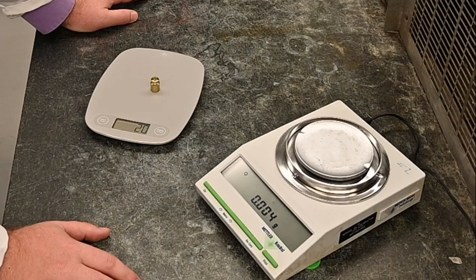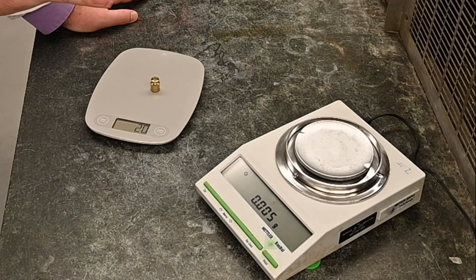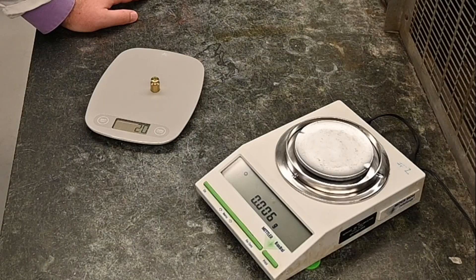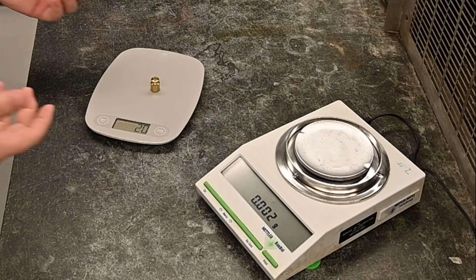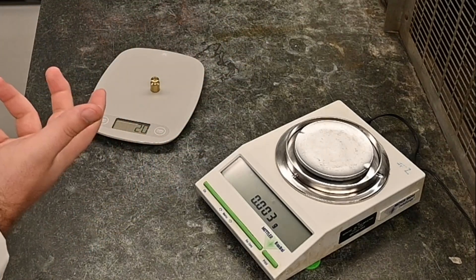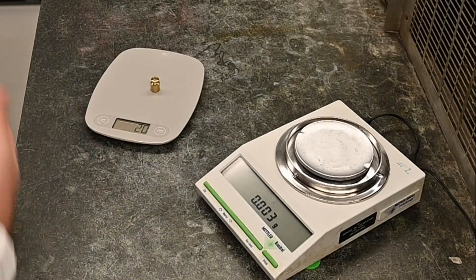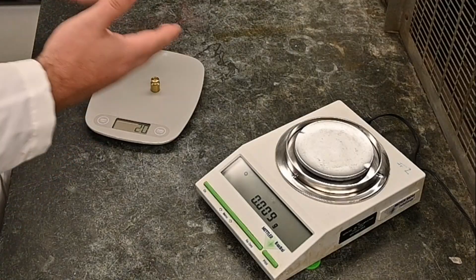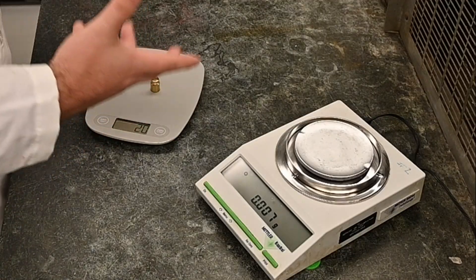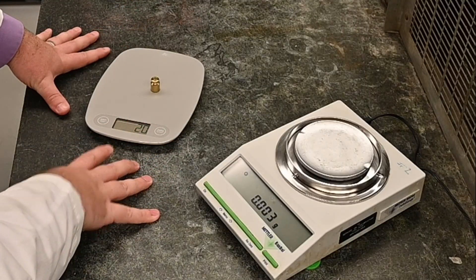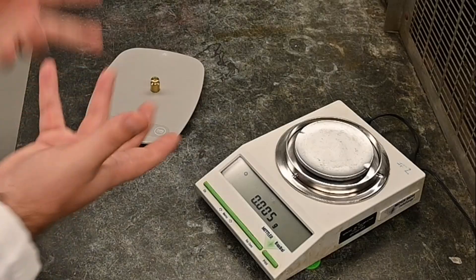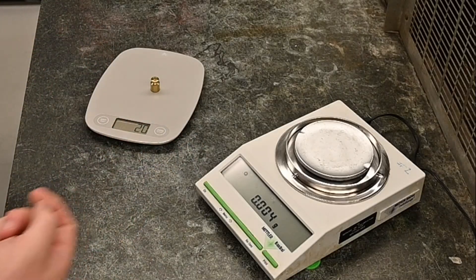But what if you wanted to measure something that was like a liquid or a loose solid like sand or something like that? Well, then you would need a container. The problem is if you put the container on there and try to measure the liquid with it, what's going to end up happening is you're going to measure the container with it. So what do you do?